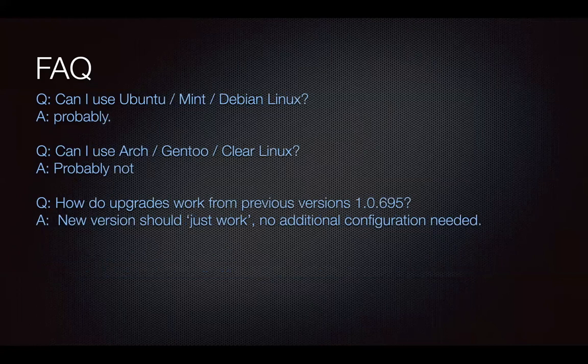Can you use this on other Linux distributions? A lot of people use Ubuntu or Mint or Debian. You can probably use this without any problems. I have to admit I have Ubuntu on my desktop here. But the caveat is that it's not our testing platform. We don't go through every title on Ubuntu and verify that it works.